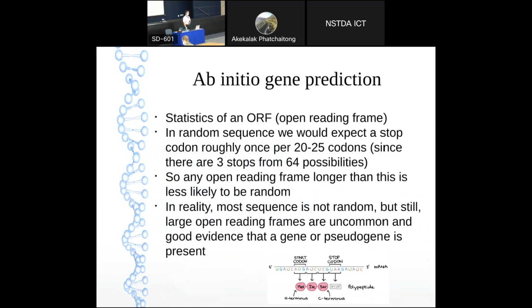This is based on the human genome. And in reality, most sequence is not random, but still large open reading frames are uncommon and pretty good evidence that we're dealing with a gene or a pseudogene.